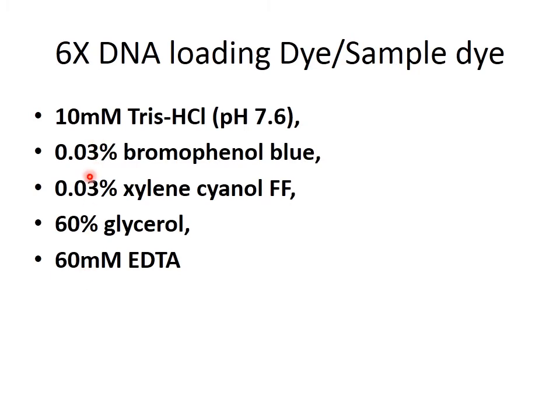In addition, the loading dye contains colored dyes in it. The commonly used dyes include bromophenol blue and xylene cyanol. Now, the solution of DNA is colorless, so it will be difficult to monitor if the solution is going to be loaded into the gel or not. Also, when the run is in progress, it would be difficult to monitor the progress of the run because the DNA solution is colorless. So it will not be possible for us to judge how much migration would have taken place.